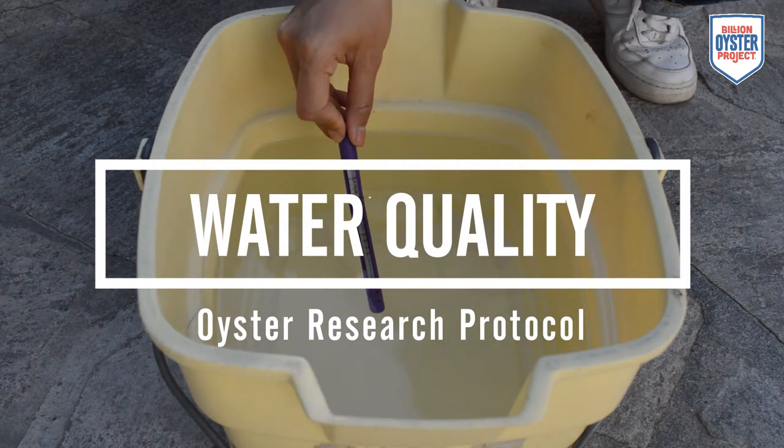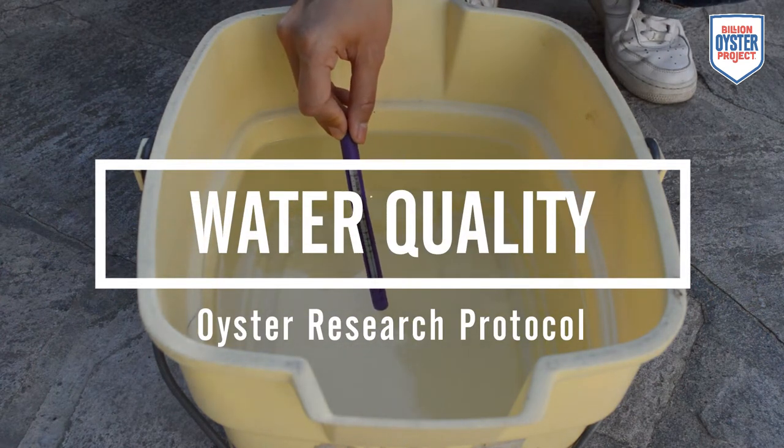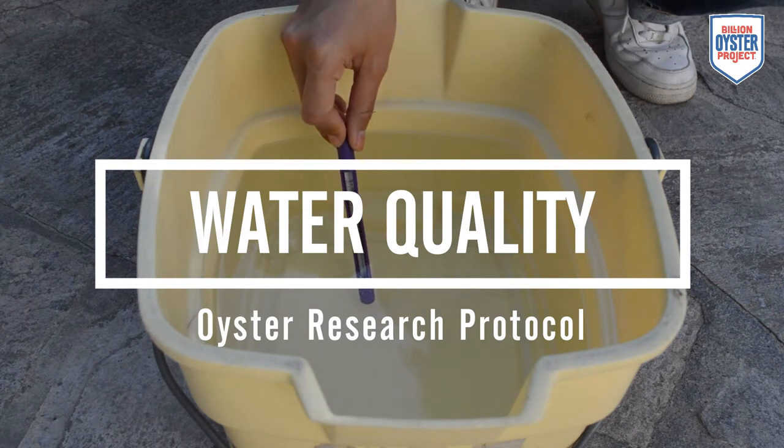Oyster Research Protocol: Water Quality. The first step of this protocol is to collect a water sample from New York Harbor. Let's go to Agata to learn how to collect our water sample.